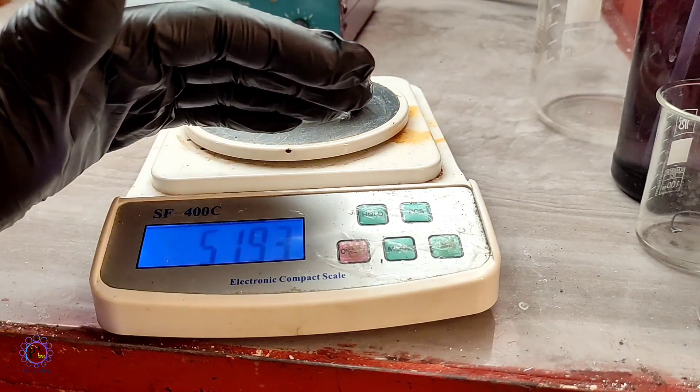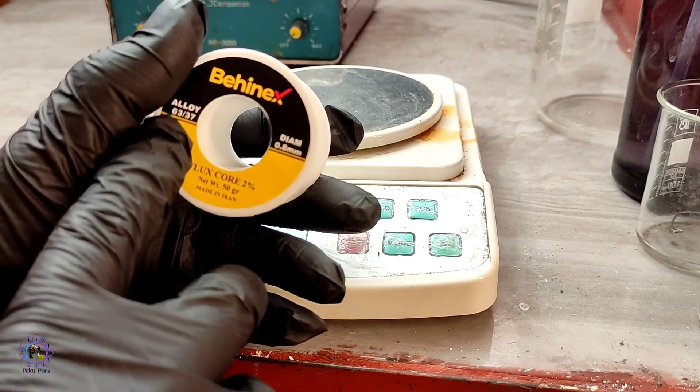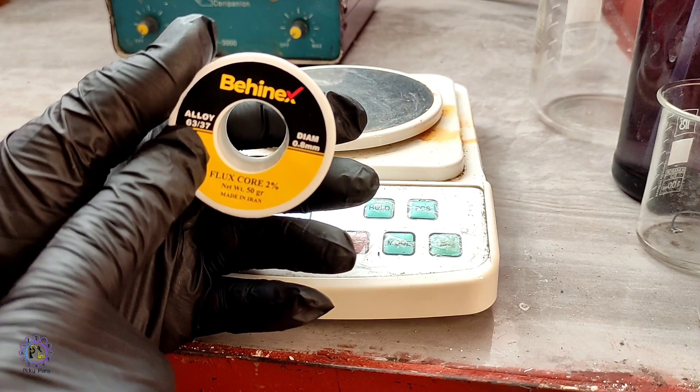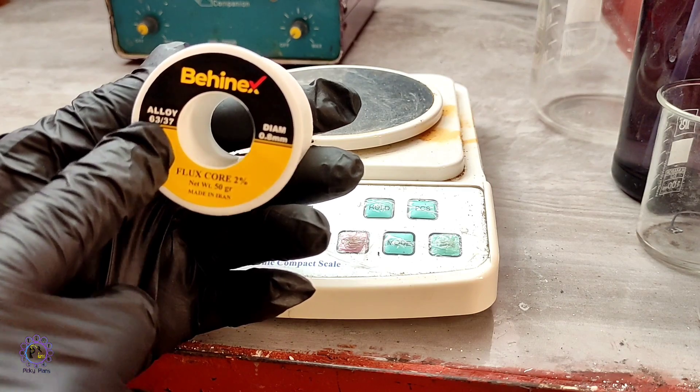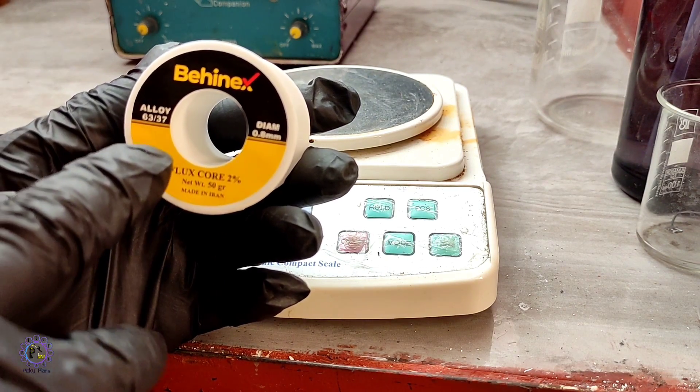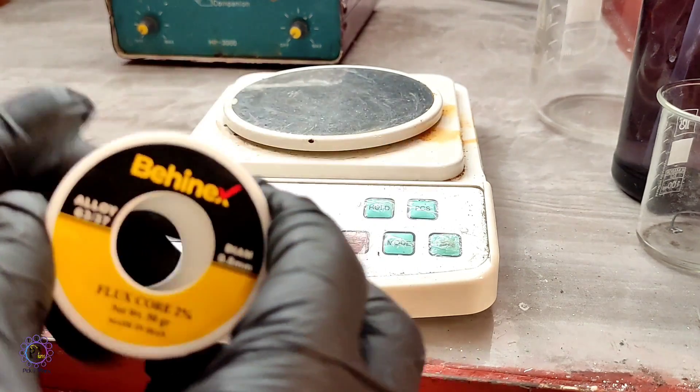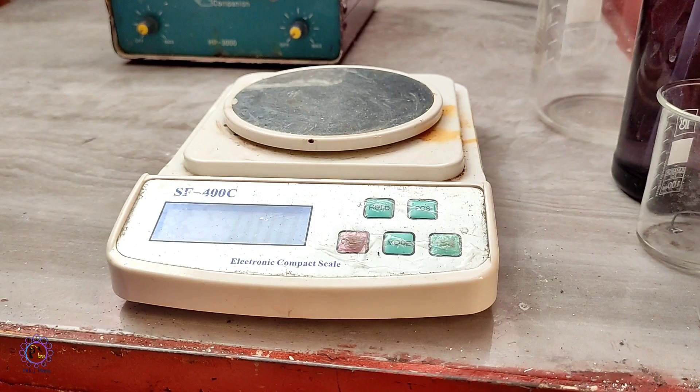This is about 52 grams of solder wire. The label says that tin content of this solder wire is 63% by weight and the rest is lead metal. So I have a decent amount of tin metal to start extraction process, which is about 31 grams of tin metal alloyed with lead.